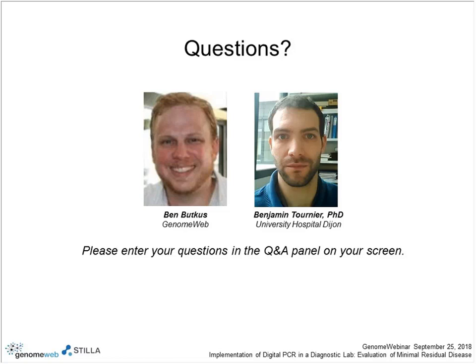It's depending on the number of samples you have to prepare, and we can evaluate this time for 1 hour to maybe 10 minutes. After, you have to load the chip, which is if you consider a free chip, it's maybe 5 to 10 minutes, depend of the technician.